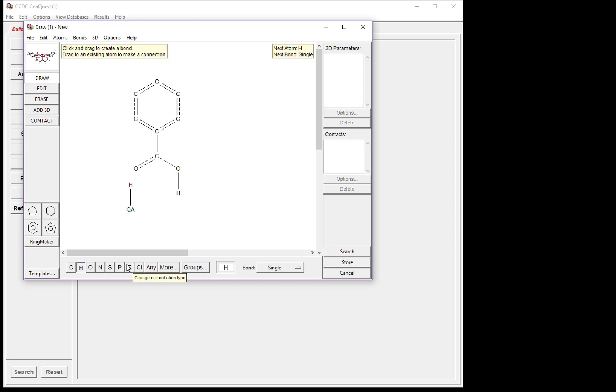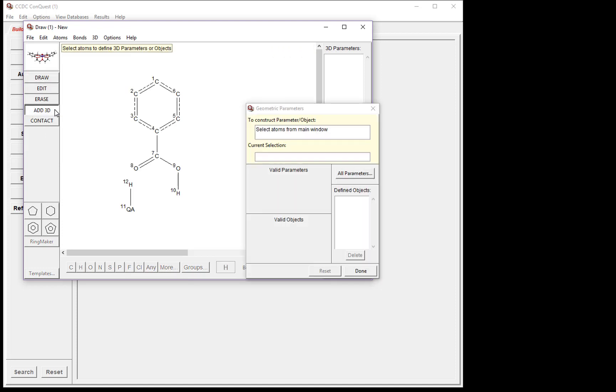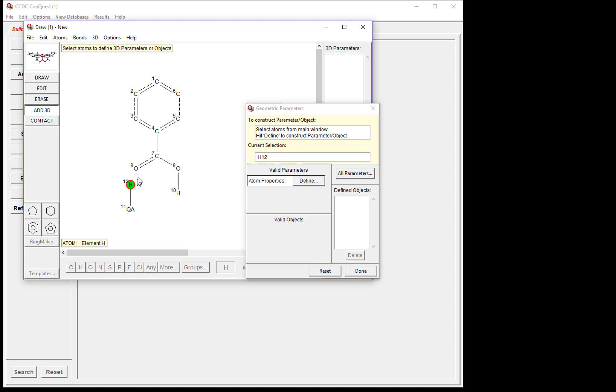Our next step is to add 3D parameters to the search. To do this, click the box that says Add 3D. This brings up the geometric parameters window. First, we'd like to investigate the distance between the hydrogen and the oxygen hydrogen bond acceptor. To do this, click to select the hydrogen and then the oxygen.